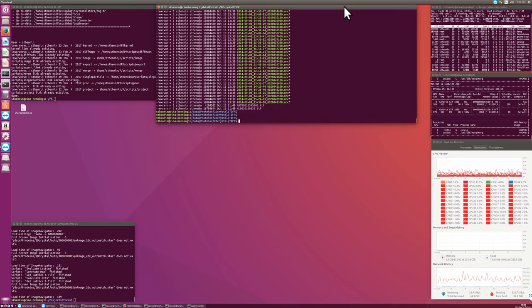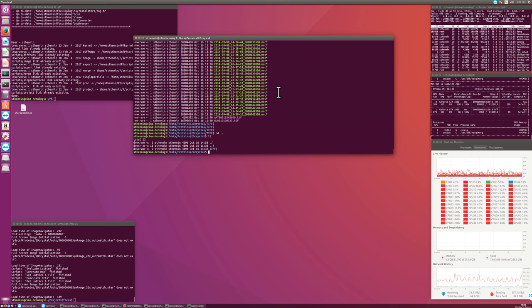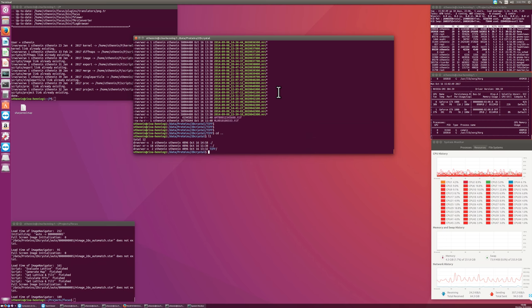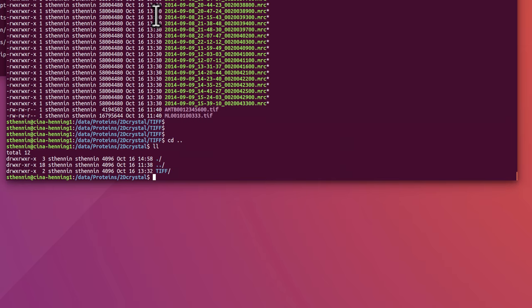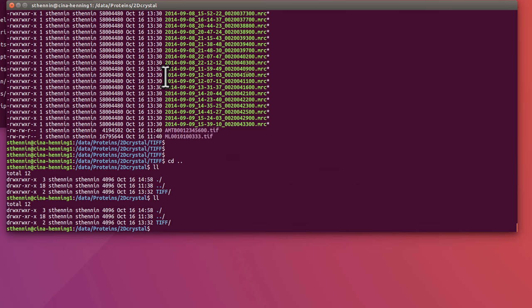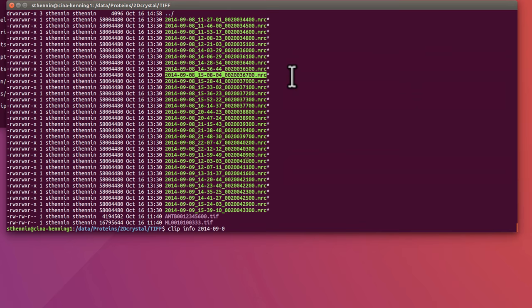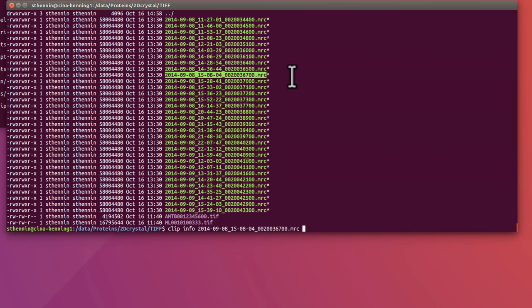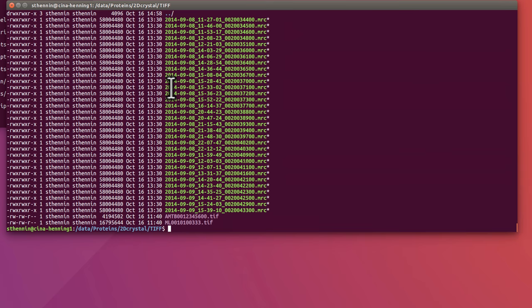I have here in the central window a collection of a few files. I'm working in a folder which is called Data Proteins/2D Crystals, which is an example folder, and in here there's just one folder called TIFF. You can call it whatever you want, you can place it also elsewhere, and in this here I have a few MRC images. If I go into one of these with clip info, for example, this shows us that these are 3,800 pixels in size, only one frame, and there's 1.34 angstroms per pixel. This is the MRC header that I'm looking at with the clip command.